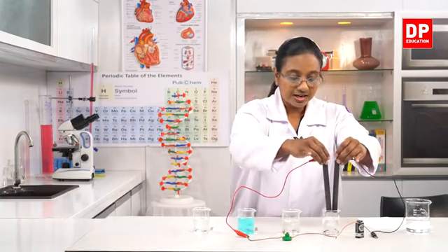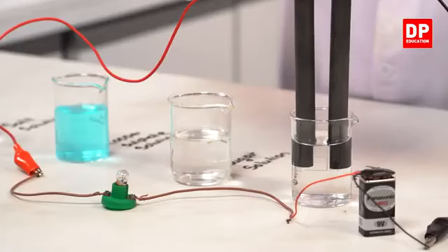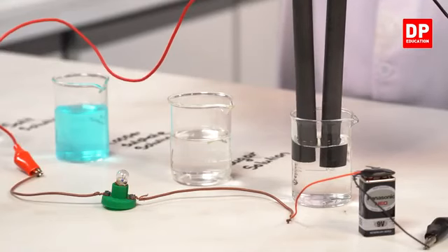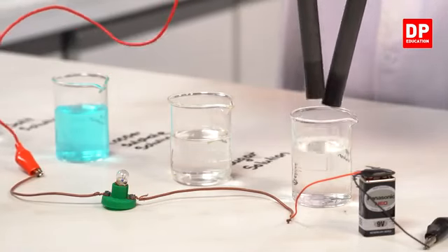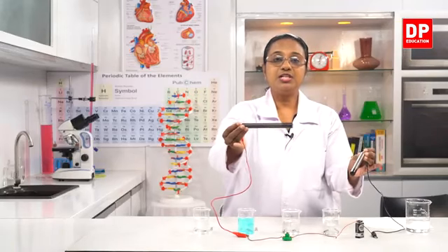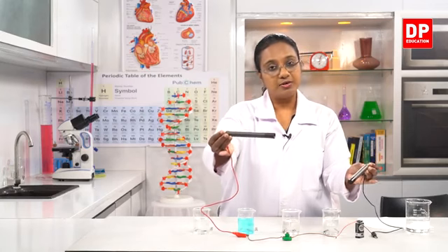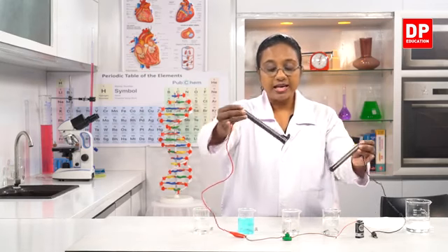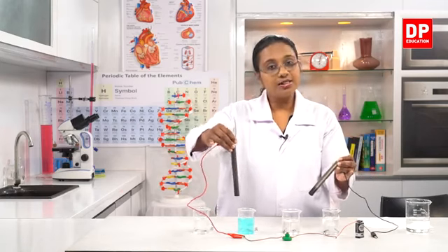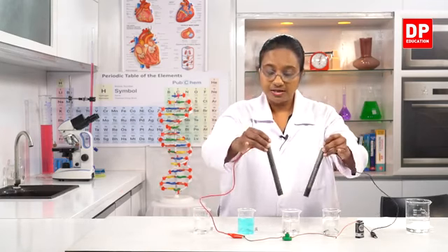So here first I will insert it into distilled water. You can see, observe the bulb does not light. That is the observation. So after inserting into the distilled water, there's no problem. I don't have to wash the electrodes. I can insert it into the sugar solution, and all the other solutions were made with distilled water.